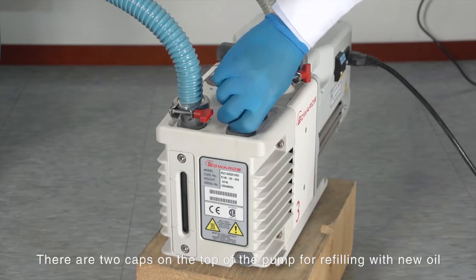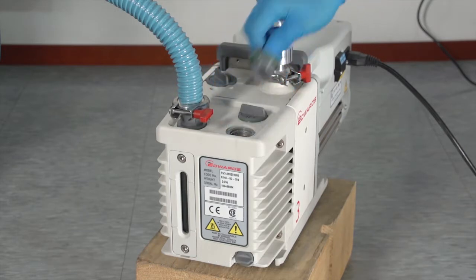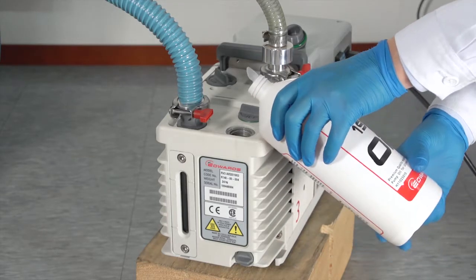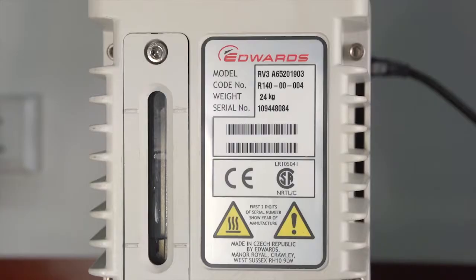There are two caps on the top of the pump for refilling with new oil. Remove either one and add oil until the level is between the two indicator lines.